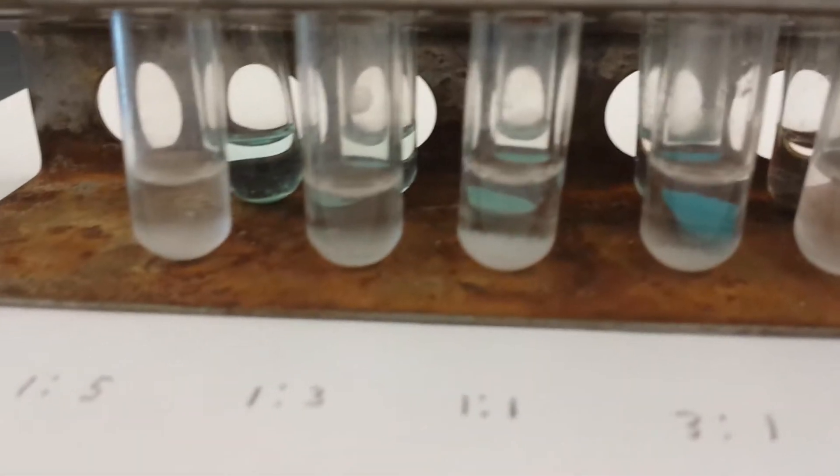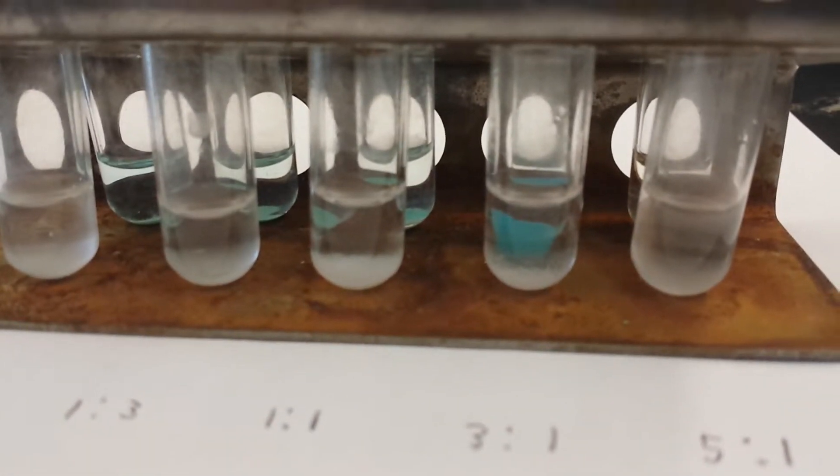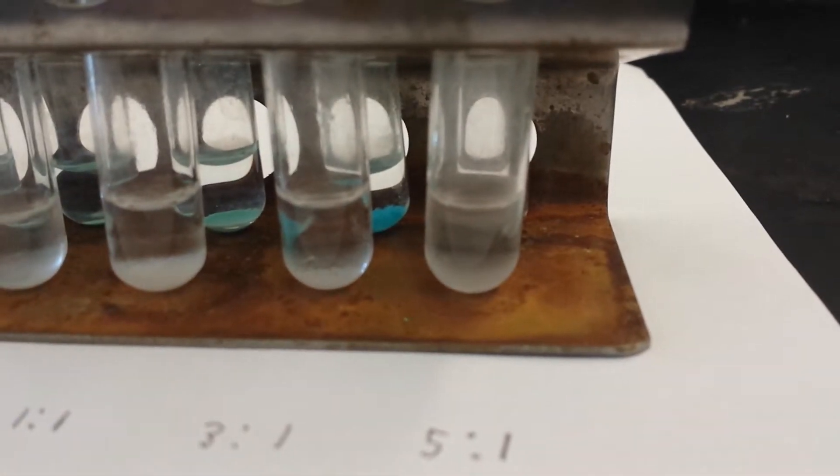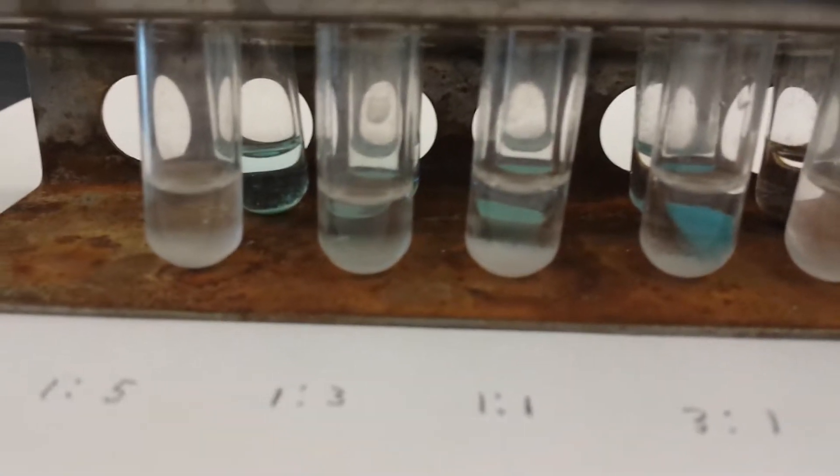And if we look at the 1 to 5 ratio, 1 to 3 ratio, 1 to 1 ratio, 3 to 1 ratio, and 5 to 1 ratio, the 1 to 1 ratio is clearly the biggest precipitate.